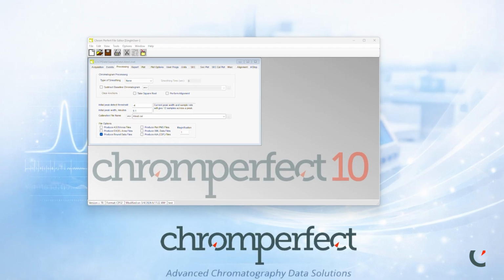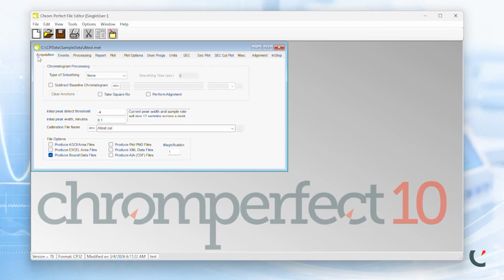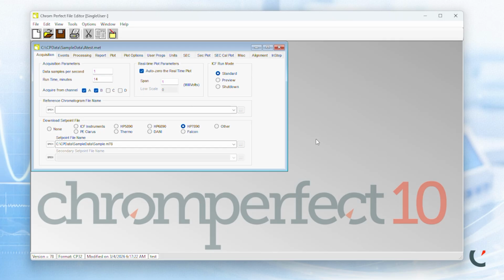I have our A-test method open within the File Editor program. Navigate to the acquisition settings and make a change to the runtime to reflect a time which allows all your peaks to elute. For my example, I am going to change the runtime to 10 minutes.